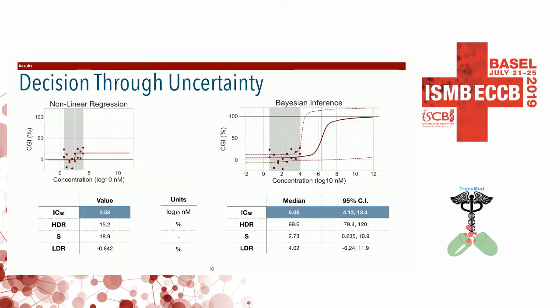If we compare the conclusion from the nonlinear regression and our Bayesian approach, we see that the final conclusions are the same, but with our Bayesian approach, we can get there in a more straightforward fashion. If we look at the IC50, we see that it's very hard to pinpoint the value it would take, but the distribution mainly takes very high values. So we could say that this compound is probably not effective, compared to the nonlinear regression, where we would only look at the IC50, which would have a somewhat satisfactory value.